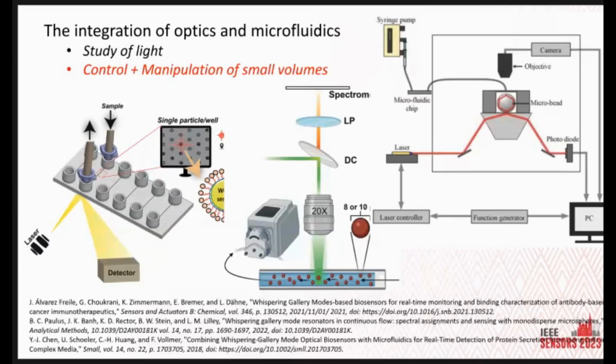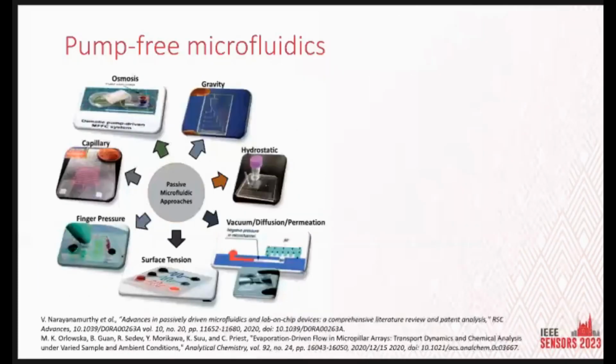So that's not really what we want to do on the chip. So our lab has developed a pump-free microfluidics to combine with optical methods for sensing devices.